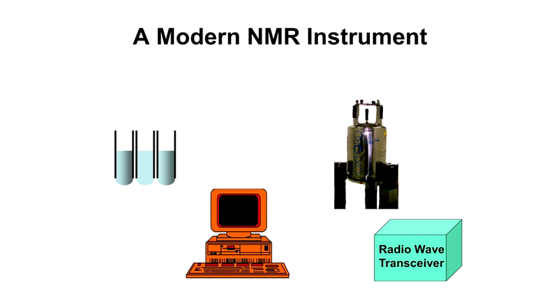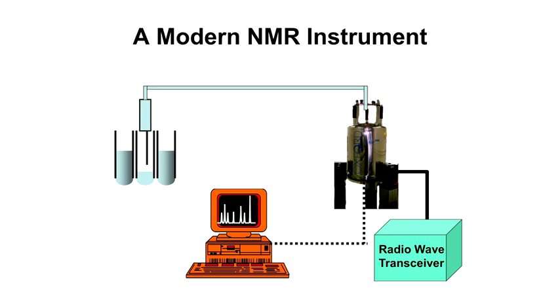So you've seen this picture before. Most NMR instruments are characterized by a magnet, superconducting magnet that sits on big legs. The magnet's about the size of a refrigerator. The samples can be either dropped in test tubes, or there are flow injection systems where you can suck the sample out and inject it directly into a flow cell.